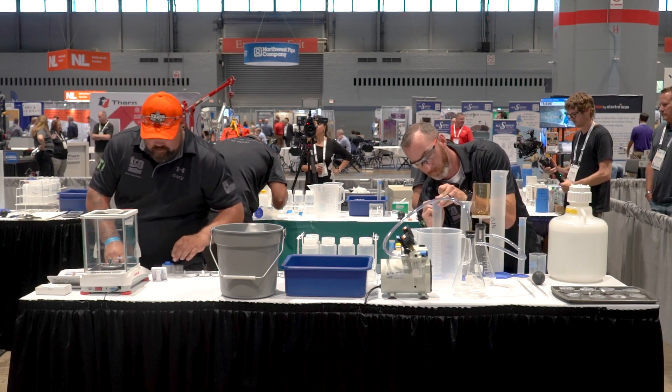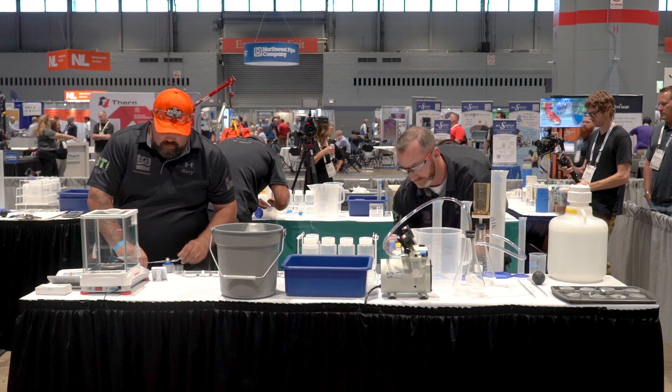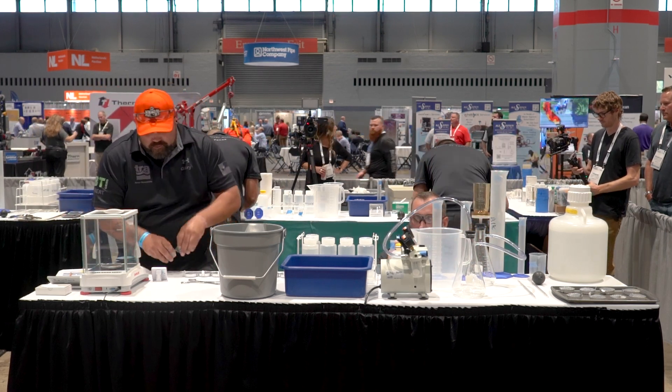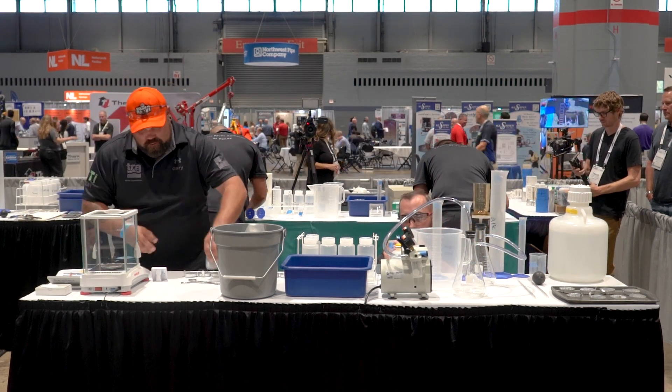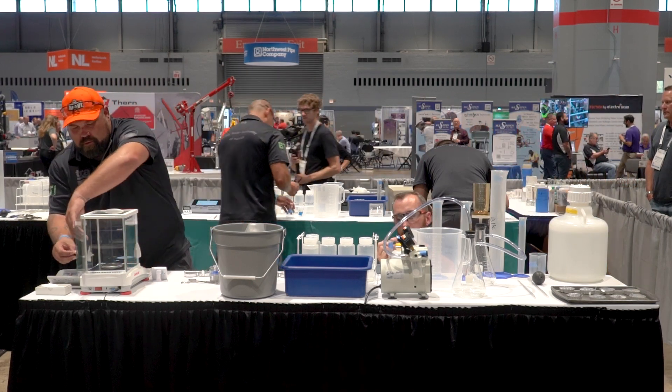On the other side of the table, you can see that he's getting ready with the magnetic filter. Label all of the equipment. Remember, please label clearly — we don't want the judges having to interpret what you have written. Make sure everything's labeled and legible.